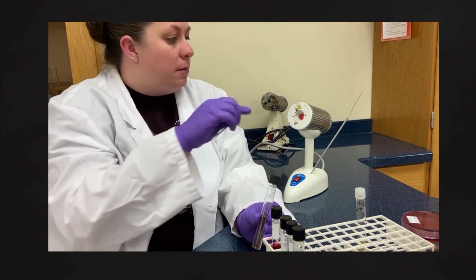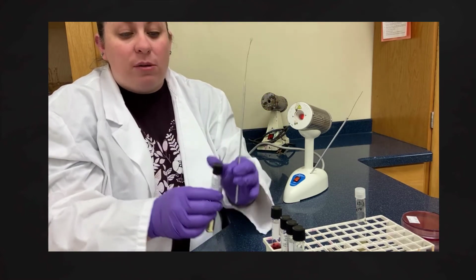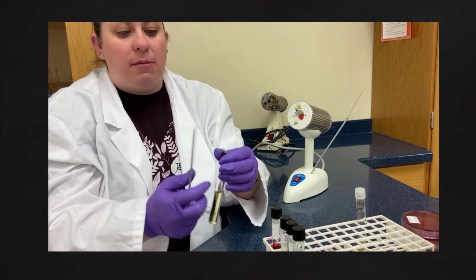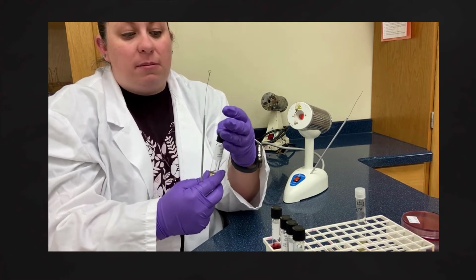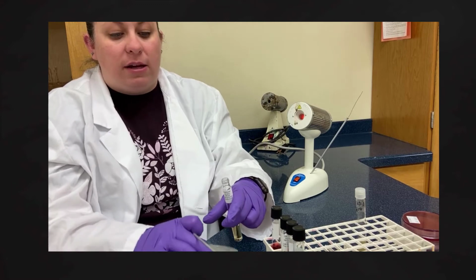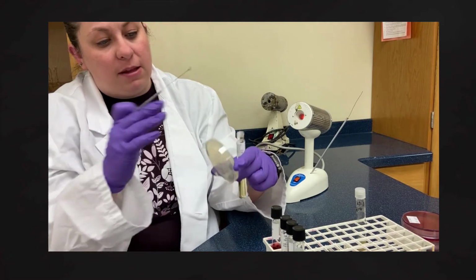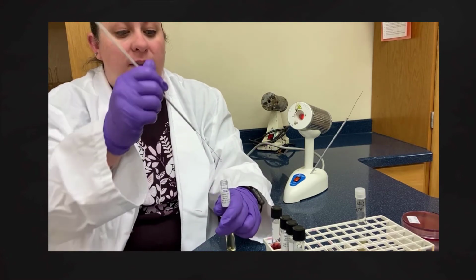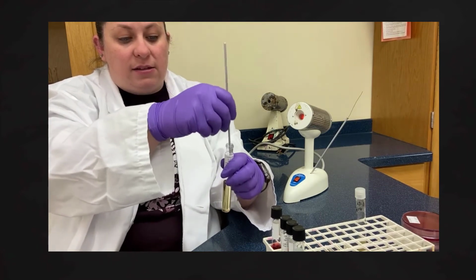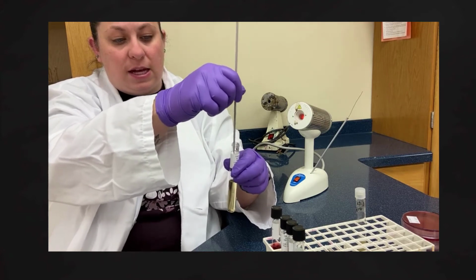Now, we are going to use our loop. We need to sterilize our loop, okay? Again, we don't want to lay any of our lids on our surfaces, because that's where contamination may take place. So I'm going to use my pinky here, and pull the lid off and hold it. I'm also going to take my plate and just tilt it up. I'm going to grab some of the bacteria, and then place it in here and just move it around. This allows the bacteria to come off my loop and into the container.